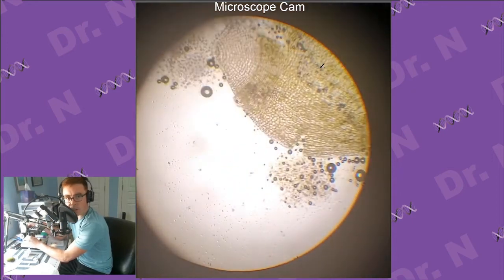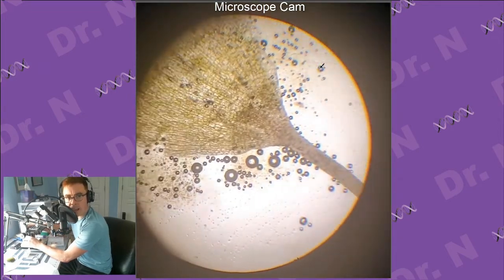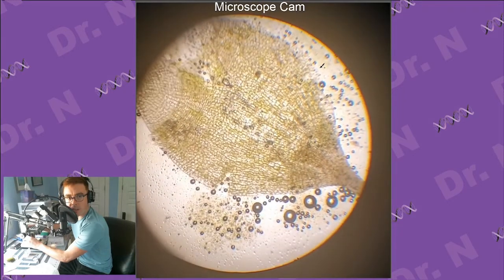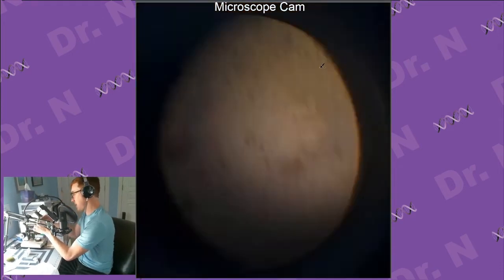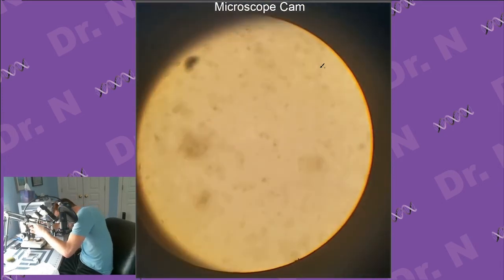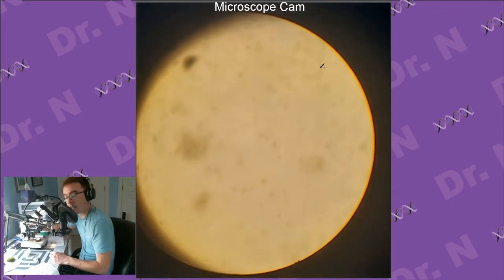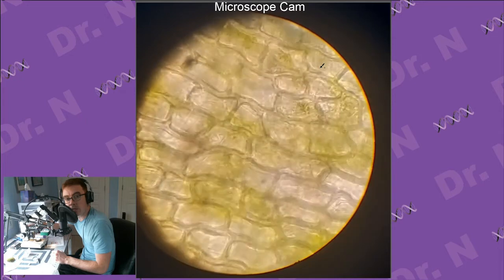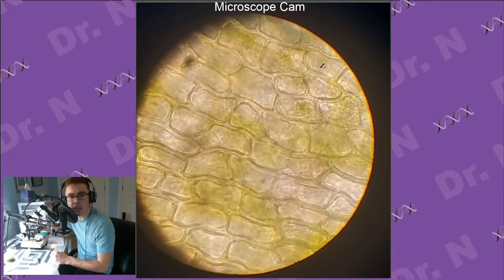All right, so this is like a little nodule that I found on top of this moss that I had. I just kind of picked it off just so we can see if anything was hanging out on top of here. If not, I'll be a little bit more aggressive and grab some of the dirt at the bottom. Let's go all the way in. Oh, there we go. Wow, very cool.